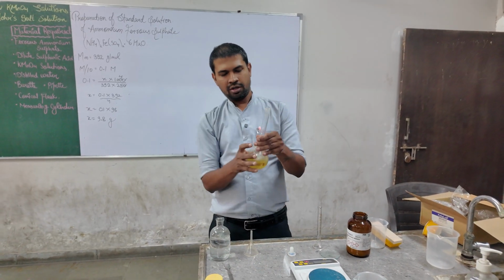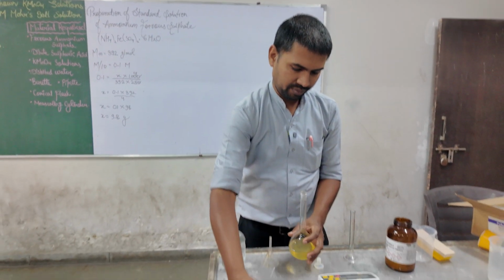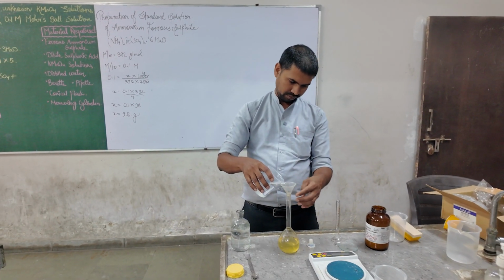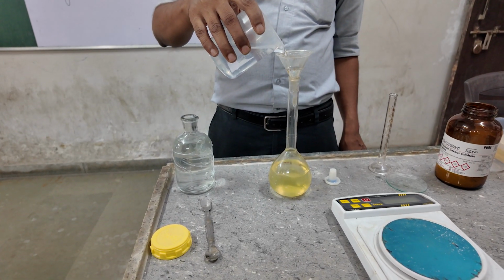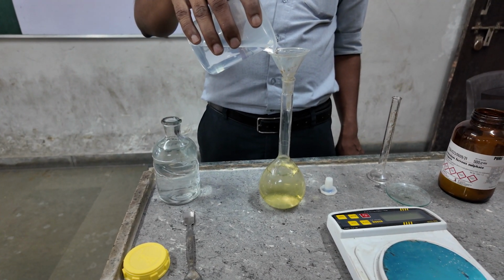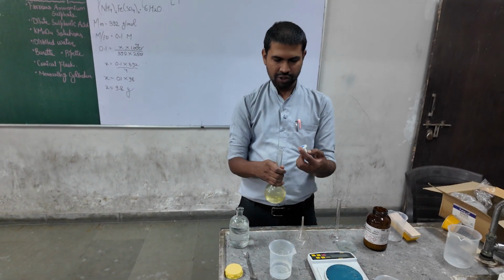Now students, you can see the mark here. So you have to fill the water up to the mark. Check it.